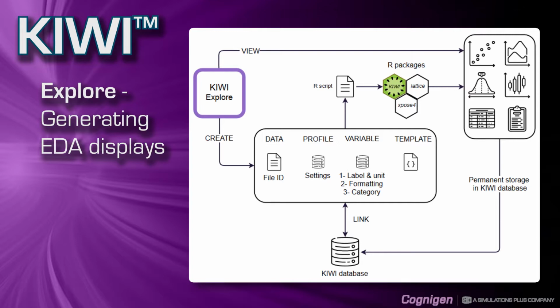This set of settings is called a profile. The creation of EDAs in KIWI is essentially done by executing a profile. So you will hear me use that term over and over again in the tutorials related to KIWI Explore. I will now switch to the actual application.